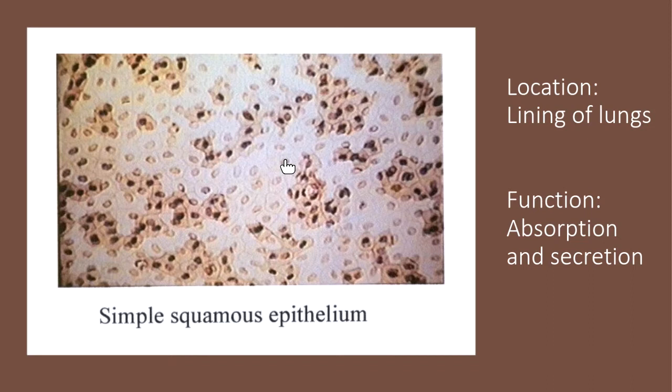Here's our image. This is the same image. All these images are the same ones you're going to see on the test. I'm not going to give you an image you've never seen. But here, whenever we look at this, I need to give you some perspective first. When we're looking at this, we're looking down through this layer, and we're looking through it almost like it's a piece of paper.